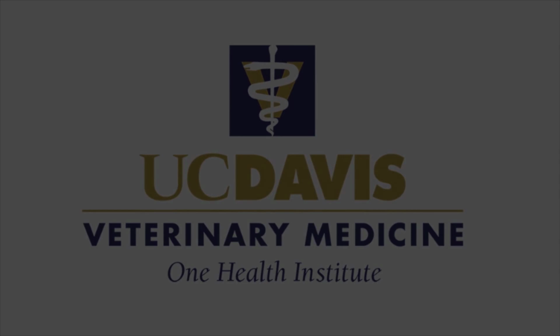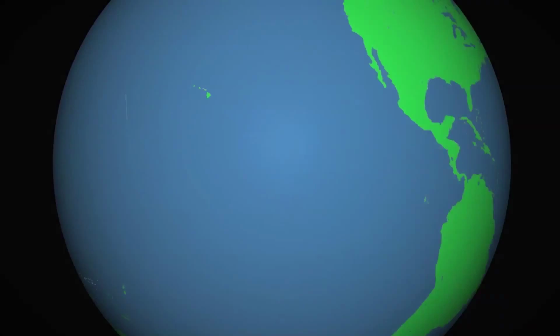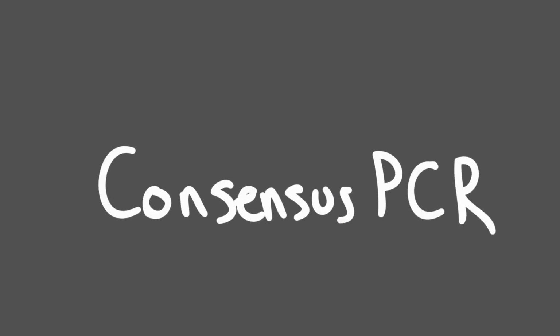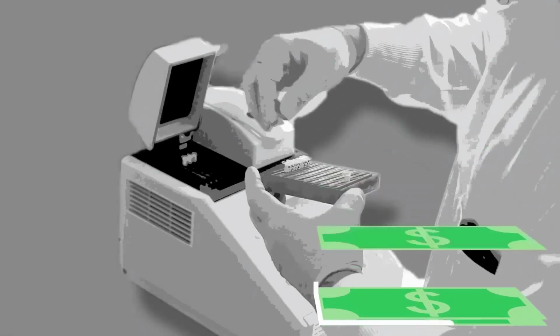Our goal with PREDICT is to find new viruses, but not just on a local scale. We're talking about finding new viruses on a global scale. Our strategy is to use consensus PCR as our main tool to test for different viral families. The reason is that it's very cheap, implementable, and sensitive, and can find both known and new viruses.